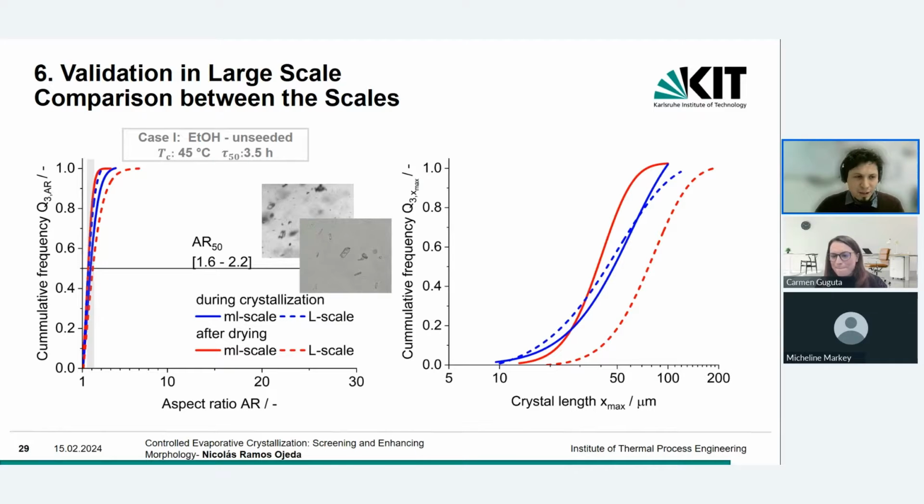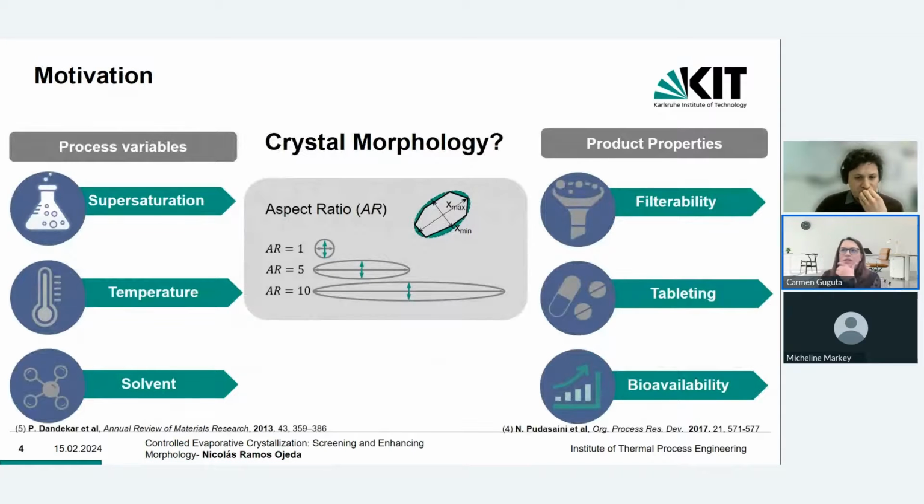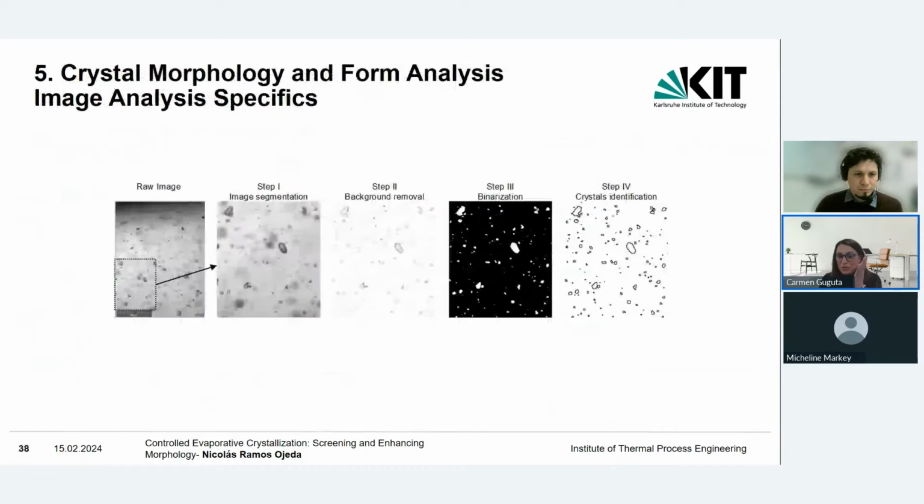We wrote that in MATLAB, and it just uses all the exported images from the crystalline, and it performs the analysis of the aspect ratio. Because we do have something now in the second version of the crystalline that was launched, in the software. It just popped up to me because recently I visited a customer and we were discussing this aspect ratio that is now available, but I saw the picture of the V1, so that's why it triggered me.